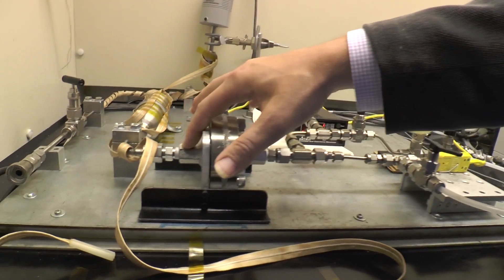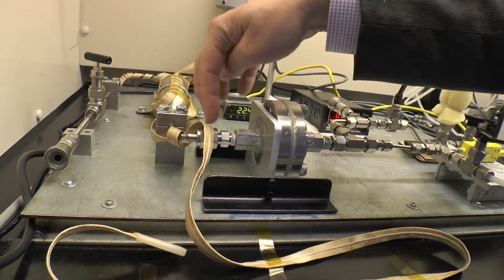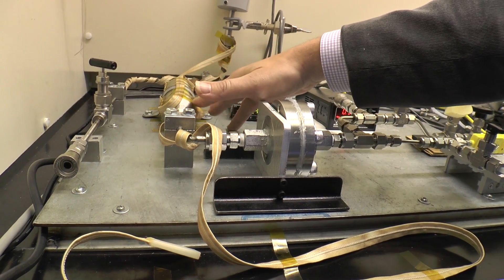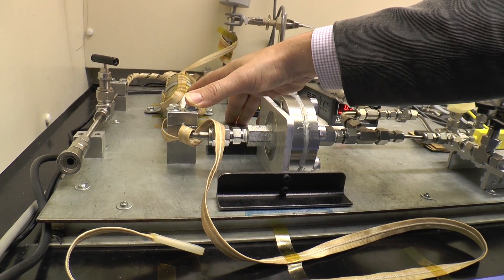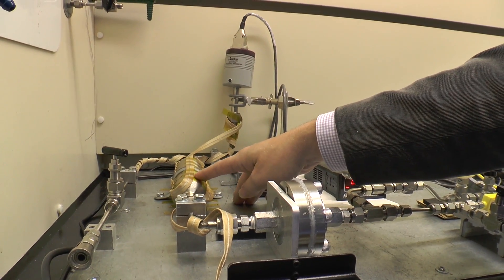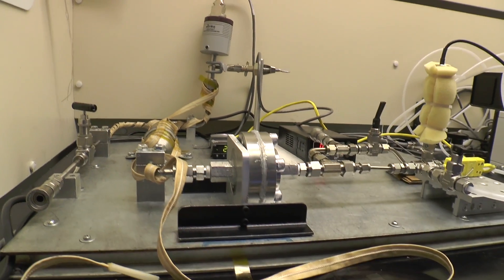On the opposite side of the film we've pulled vacuum down throughout this entire gas line including this gas chamber, so that initially this is under a high vacuum as driven by the pump. We then have a pressure sensor that measures the pressure in this chamber as it back fills up with hydrogen permeating across this membrane.